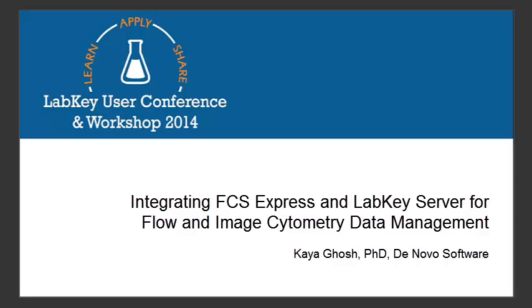Hi everyone, I did the live demo with FCS Express and LabKey, and I just wanted to mention that I tracked down the source of the error. The source of the error was me. I forgot to enter in the name of a data field into the XML node of the batch processing function of FCS Express, so I just wanted to show you that everything's functioning as expected, both on the FCS Express side and of course the LabKey side.